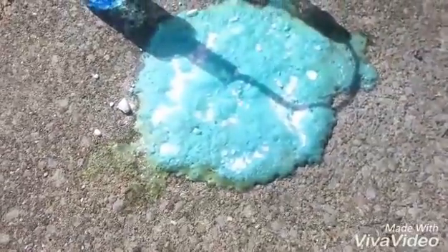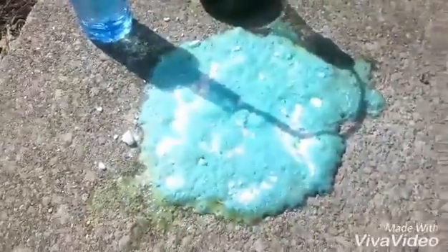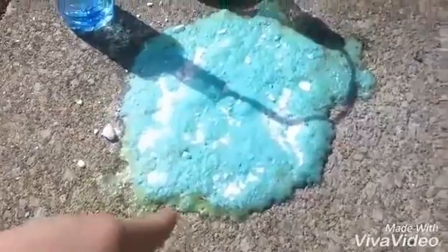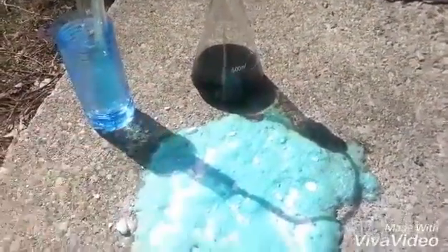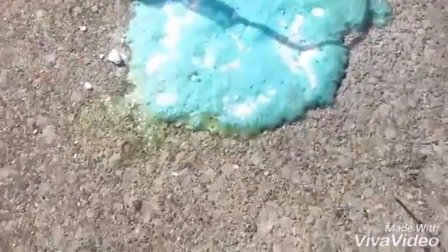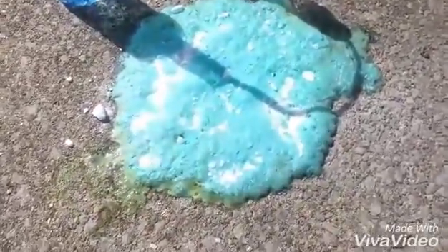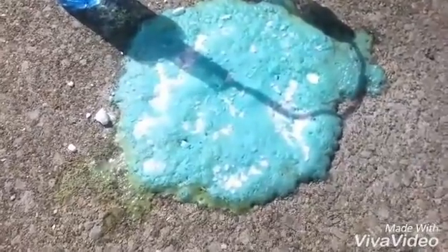As you can notice by the color change of dumping the sodium bicarbonate onto the spilled acid, it turned from a green color to a blue, because what was in this acid mixture was copper chloride, because of copper and hydrochloric acid, and some copper nitrate as well, and the sodium bicarbonate mixed with it formed copper carbonate, which is this blue color.